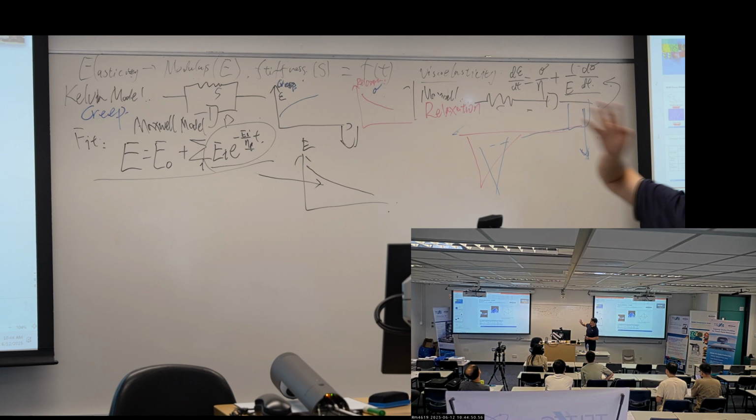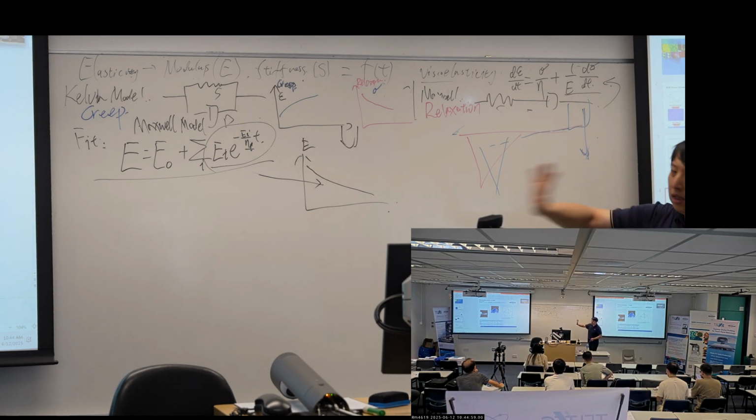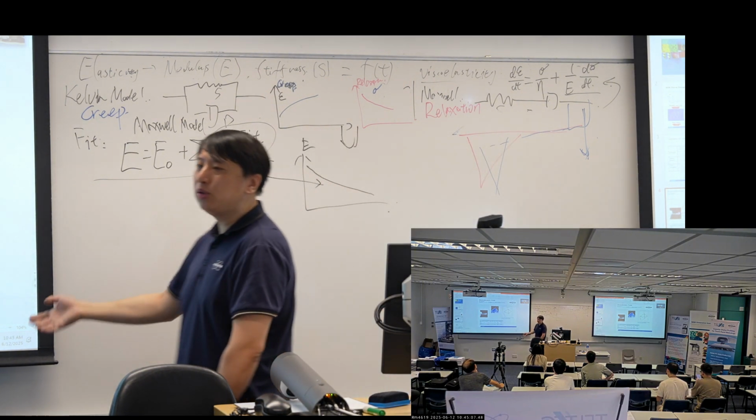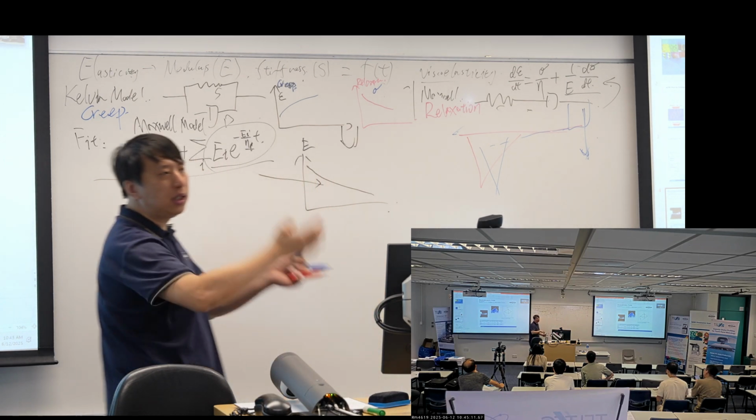So we will cause a lateral movement of the probe when we apply force. This kind of lateral movement is not what we want. But for small force, like when we apply several micronewtons, this lateral movement is so tiny, we can ignore it.